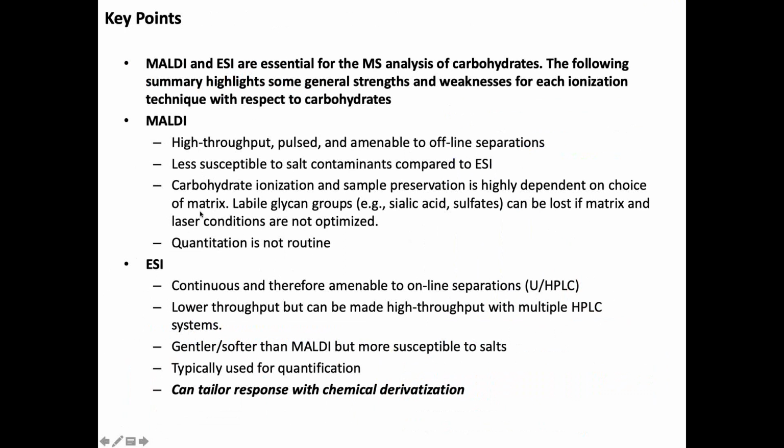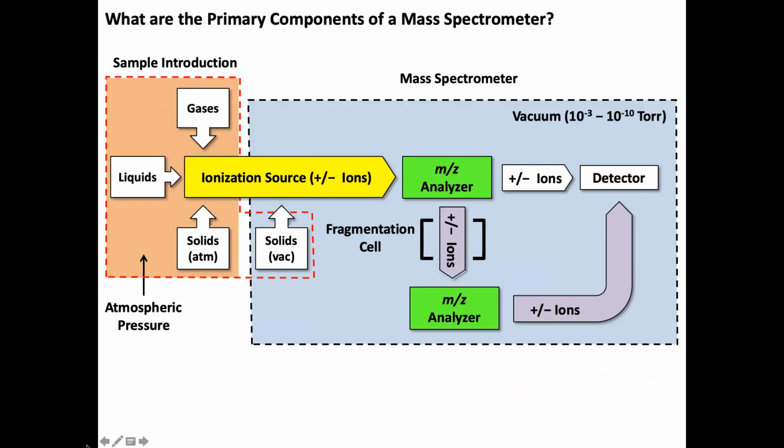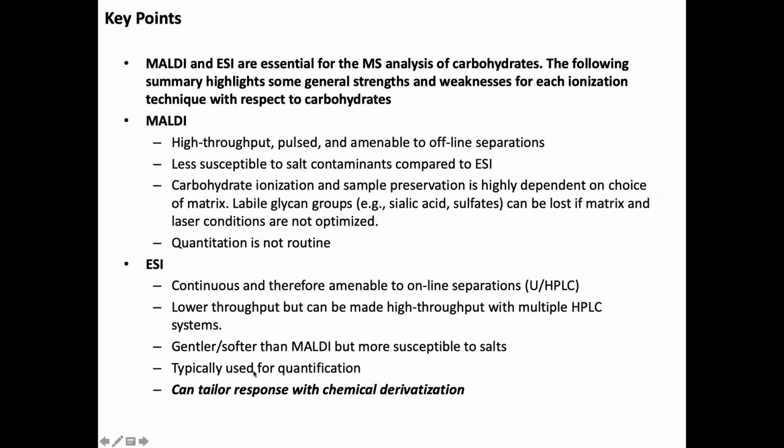So these are some key points, which I'm not going to belabor to keep going. But the bottom one, which I added, I guess, later, is this issue of how you can tailor the electrospray response to chemical derivatization. And that's a really important factor when you're talking about these really hydrophilic carbohydrate molecules. And so there's a whole host of literature out there just focused on that alone.